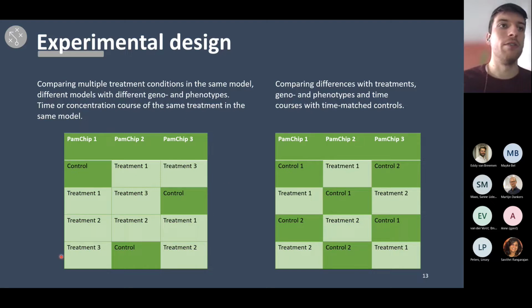But in this case, you have 3 replicates of the same samples, nicely balanced and spread over the chips, which means we can also perform ComBat correction during the analysis and really get the best statistical result from that.